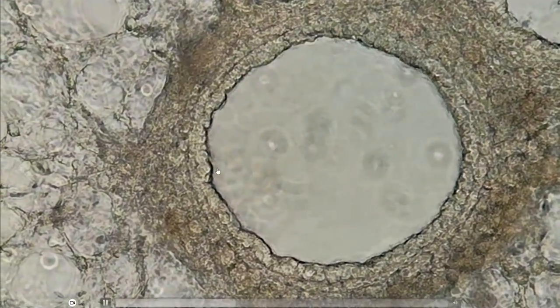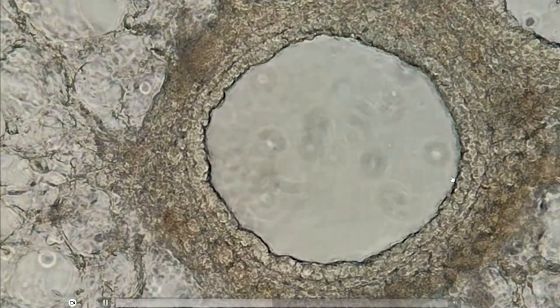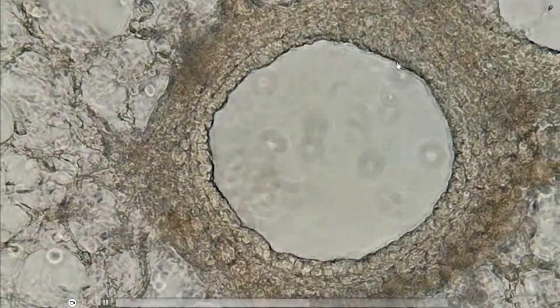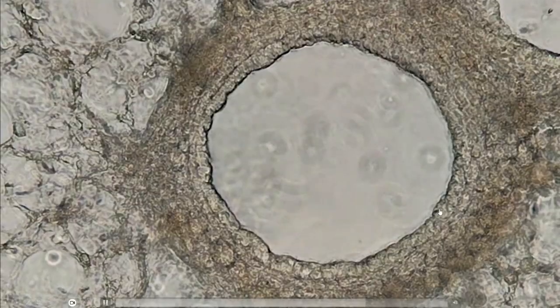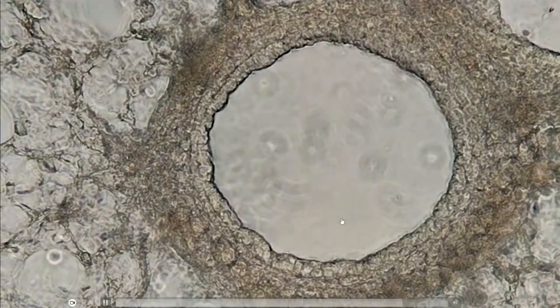So this is when you do this in mouse. It will also happen in monkey or human, or it should happen. You should see cilia beating with any animal. But this is a nice example of a healthy slice and what you would like to see when you have good clean slices.